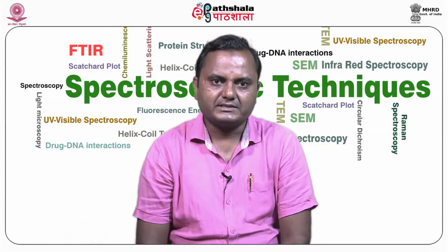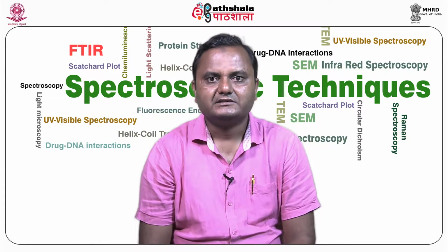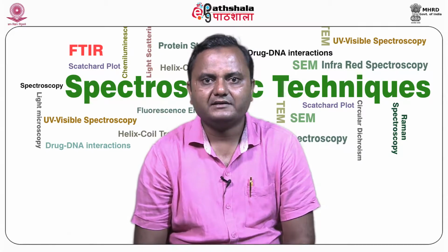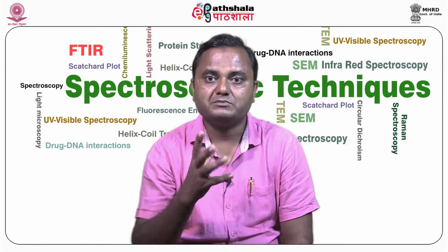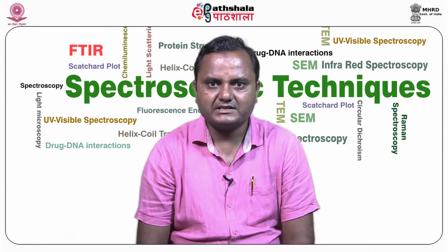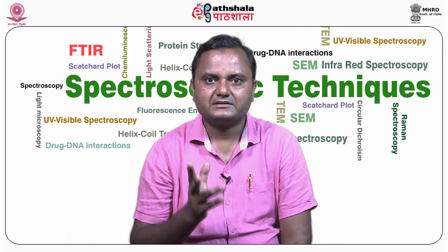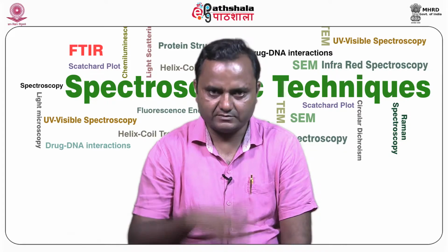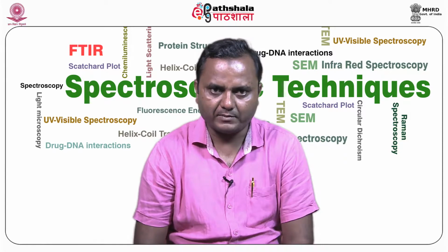Now, we will talk about some benefits of this technique. It is a well established technique, easy to operate, and yields highly reproducible data. Apart from this, it has some disadvantages or drawbacks, that is, the diluted sample changes in properties, and there is a tendency to oversize large weight particles and overestimate the number of small particles.